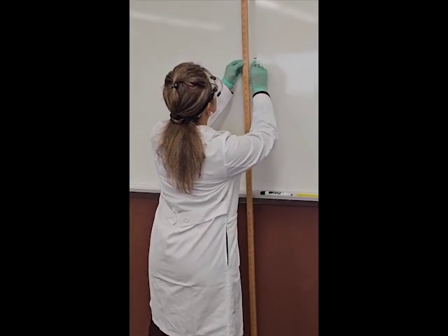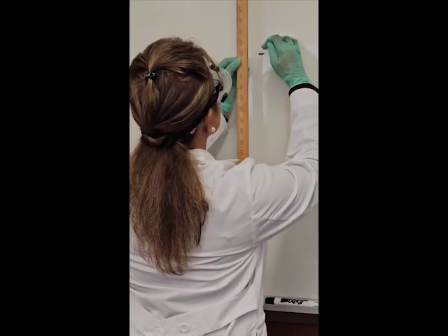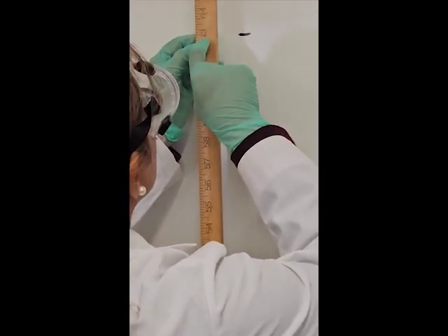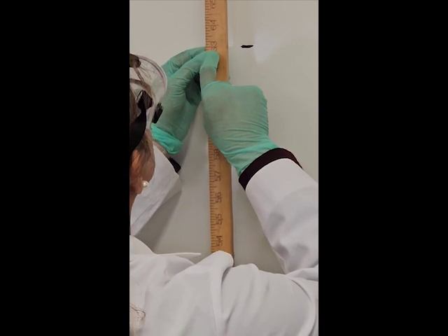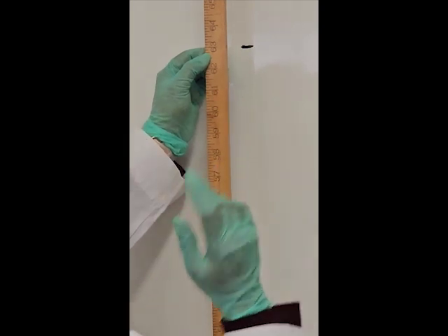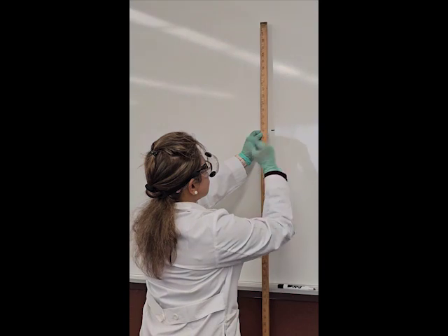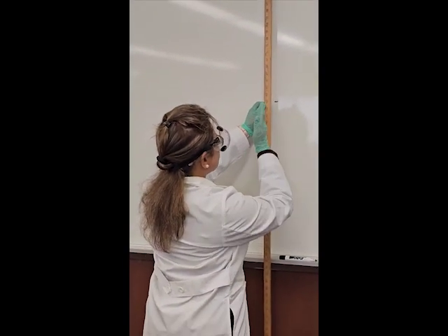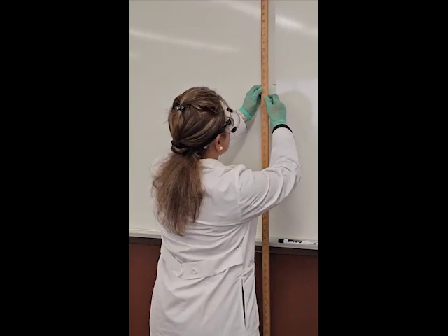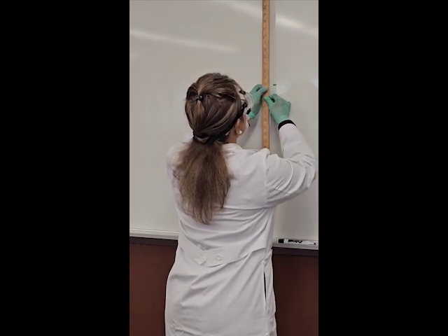62.5. I can see. When you take the measure, it should be at eye level so that you can see. I think it's not there. So it's 62.8. That's why we always have to remember, when you take the measurement, it should be at eye level. Otherwise, you see from below and you can get a wrong reading. So always be at eye level so that you can see the measurement.